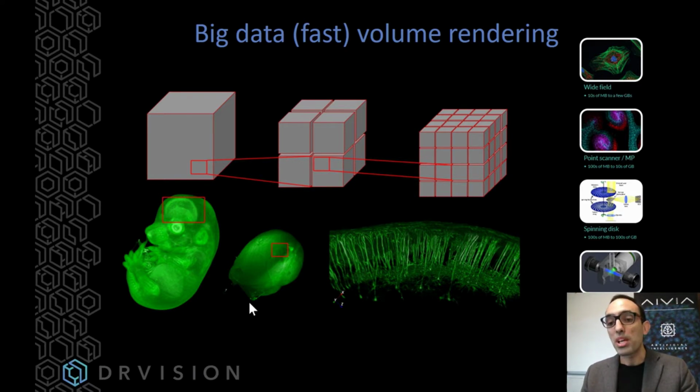And it does that by quickly swapping in and out the information that is required at each zoom level when you're panning and moving around your data set. That in itself was already very good, but the best part was actually the algorithm for determining what that architecture should be. And we have, I believe, the only one that is dynamic.